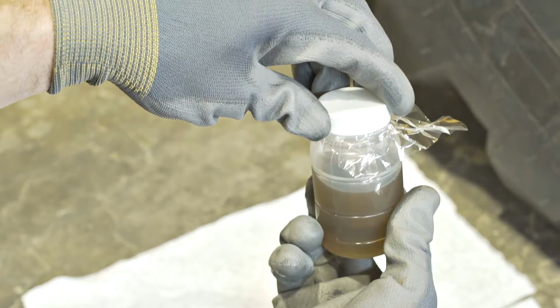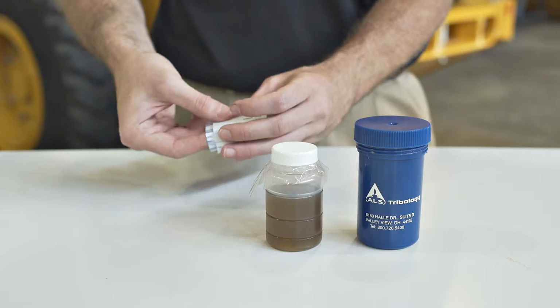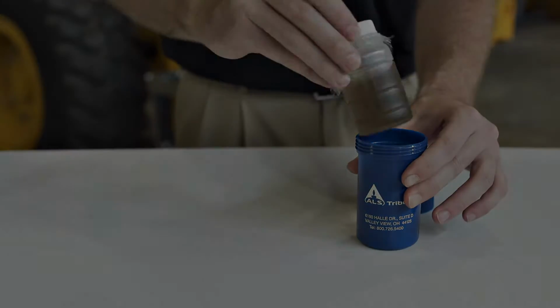Fill out the sample information form completely and submit the form and sample to the designated regional lab for testing as soon as possible. This will ensure timely and relevant information.